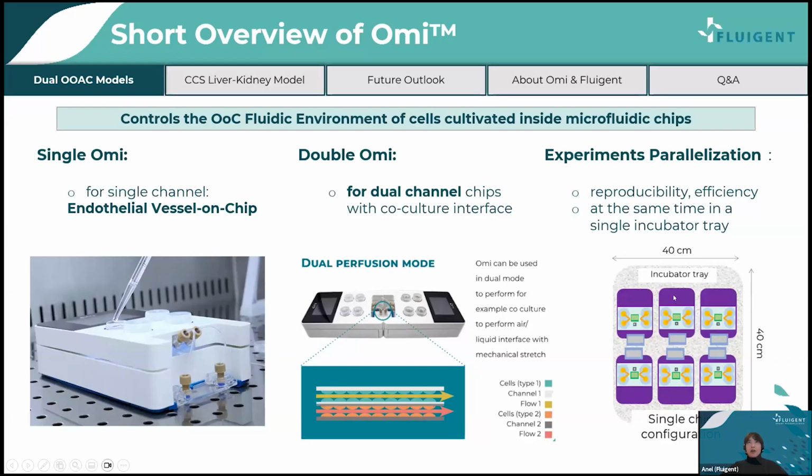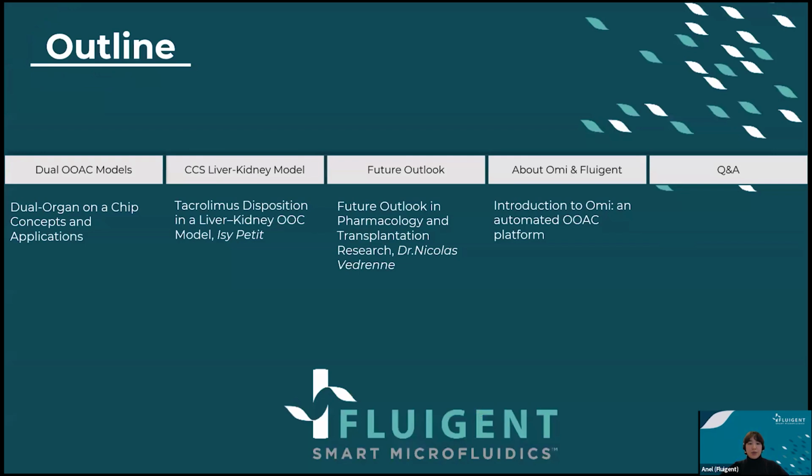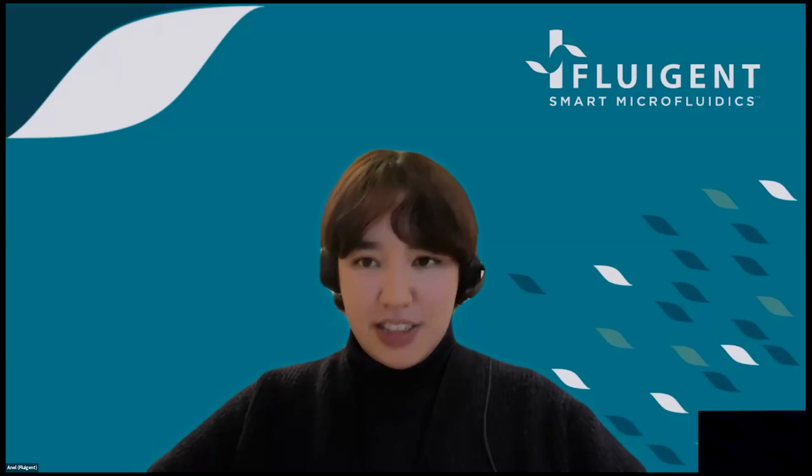So if it wasn't clear, we will return to how Omi works and its functions. Please do not hesitate to write all of your questions in the Q&A panel. And now I would like to pass the floor to Izzy Petit, who will guide us through the liver-kidney organ-on-chip setup established in their laboratory in Limoges and present his findings from the tacrolimus disposition study. Okay, so I will take the floor.